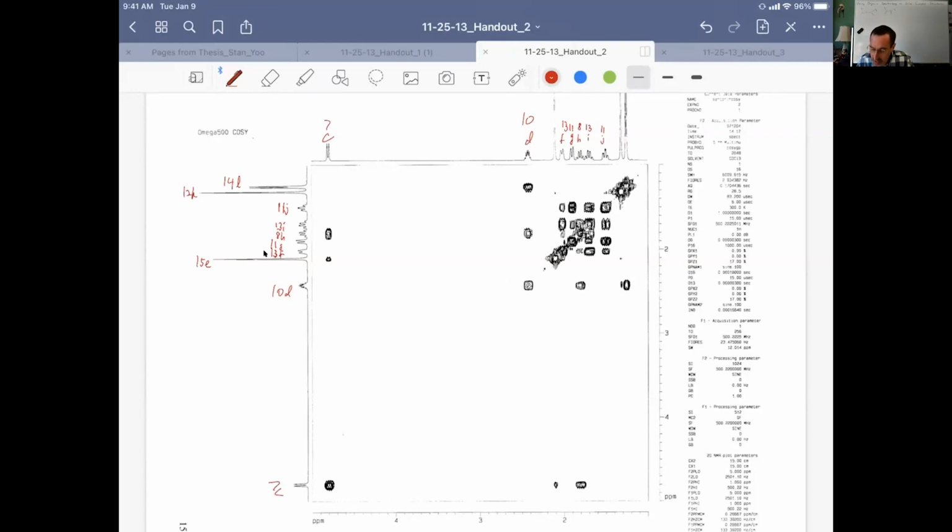And so it's being shifted far downfield. So we see this peak of 7C with 15E. That's also the peak at 7C where I said, well, we see a small coupling in addition to the big coupling. It looks like a doublet, but there's shoulders on there. So that would certainly make sense for some sort of doublet of quartets with a small J. Then we see another cross peak off of that 7C peak with 8H.